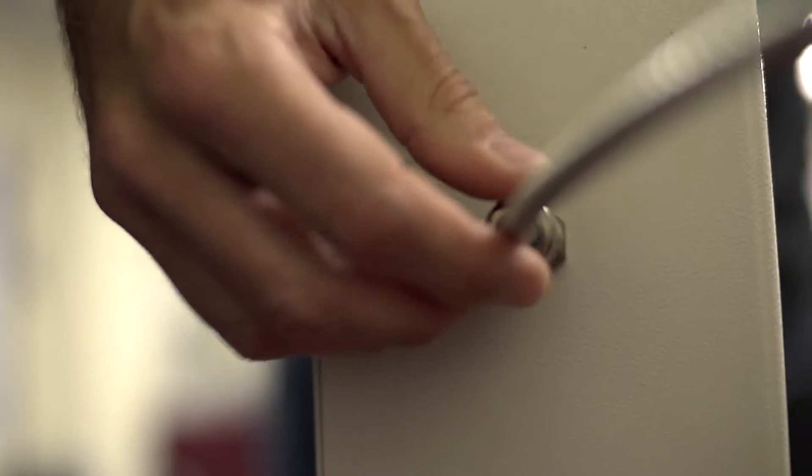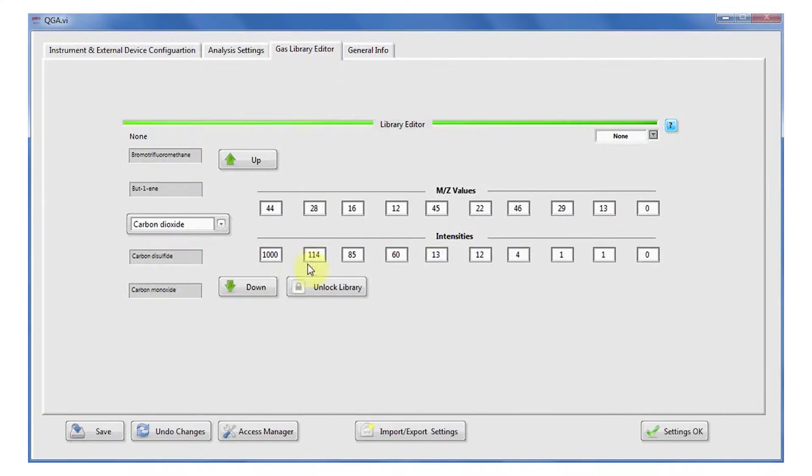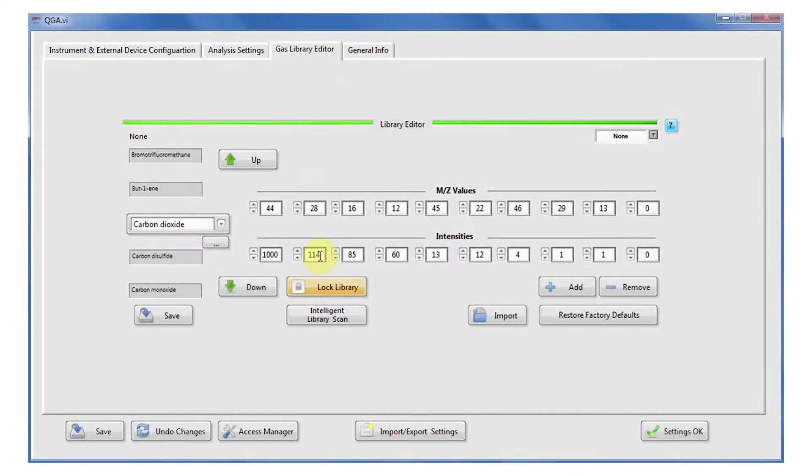The gas analyzer can take measurements at greater than 650 measurements per second. Combined with user-friendly software and gas recipe setup which can be repeatedly used, it saves time for the researcher.